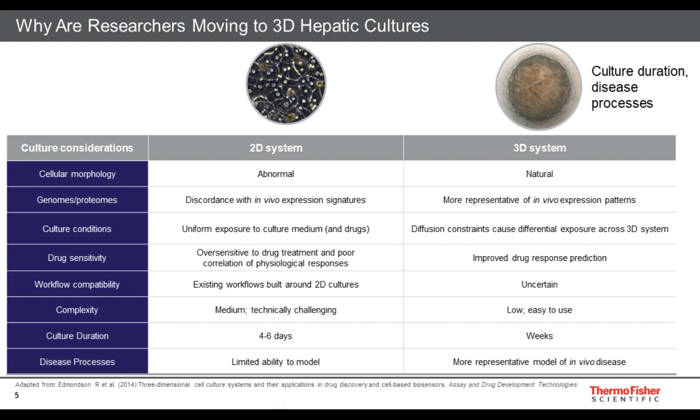You can, a week, if they plate at all, and maintaining the cultures at high viability and high levels of confluence and activity for a week is a challenge. So this provides a fairly narrow window and fairly challenging conditions to be able to do this consistently.